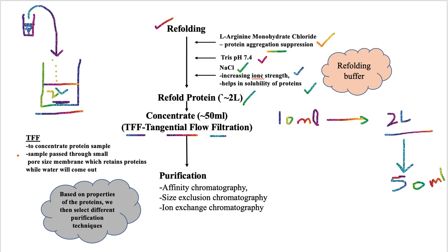So how does it work? The sample is passed through small pore size membranes installed in this system, which retains proteins while water and other chemical constituents come out.